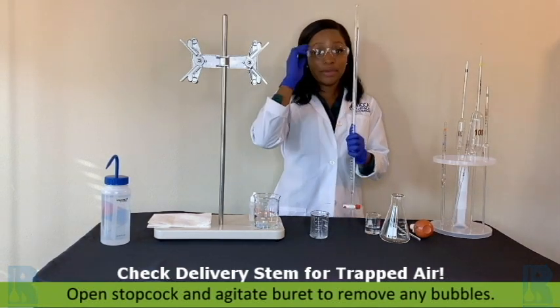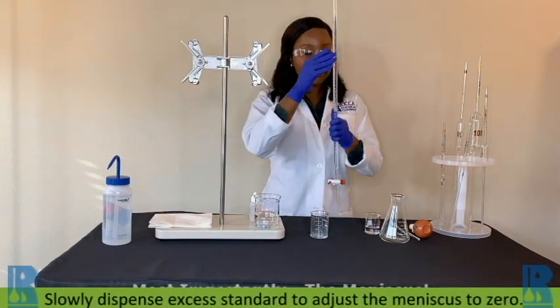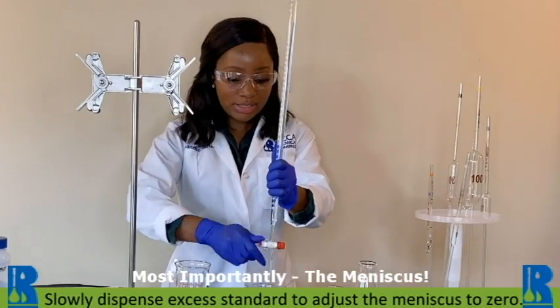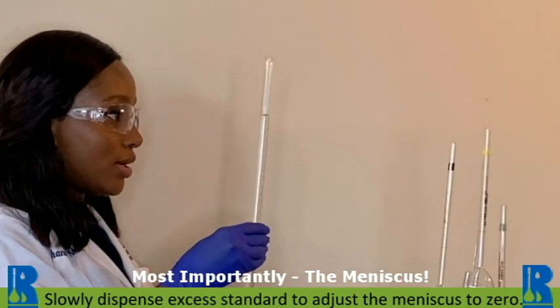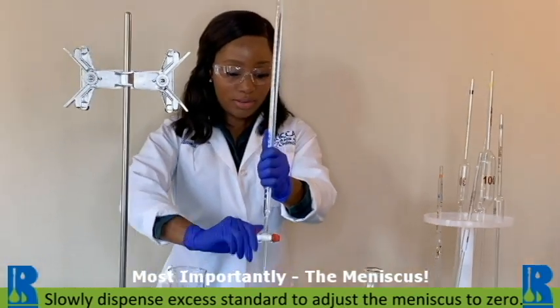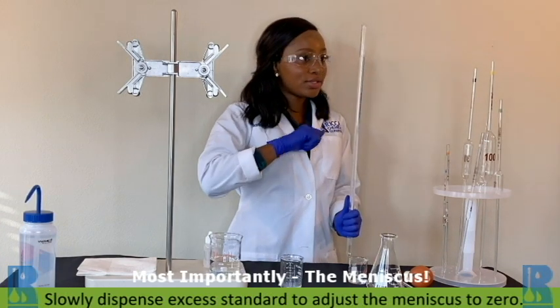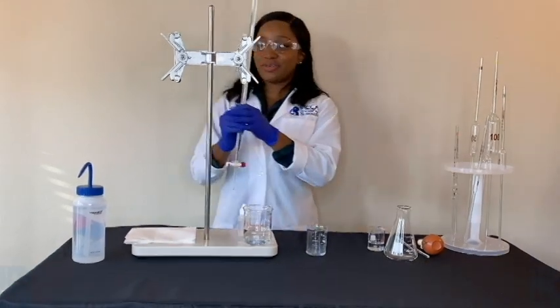Next step, and one of the most important: you want to zero that burette. In zeroing, that meniscus needs to be rested directly on the zero graduated line. I like to achieve that by doing really quick flicks, and this is perfectly at zero.